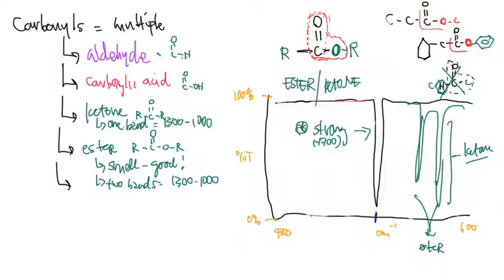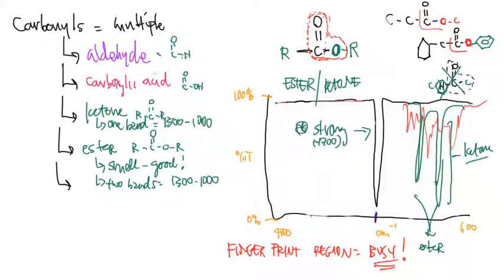The reason, and again, I'm going to write this in big red letters, is that we are working in the fingerprint region. And the fingerprint region is very, very busy. There's a lot of stuff that's going to be happening over in here that is specific to the molecule.